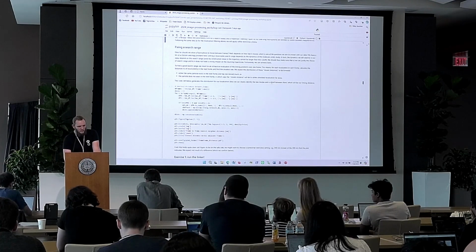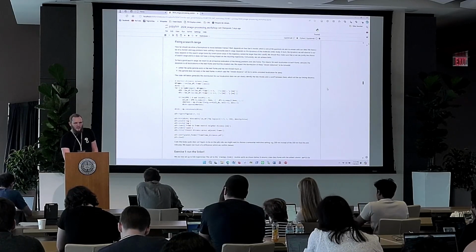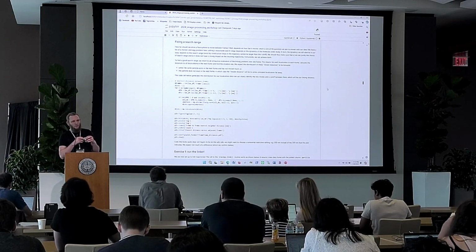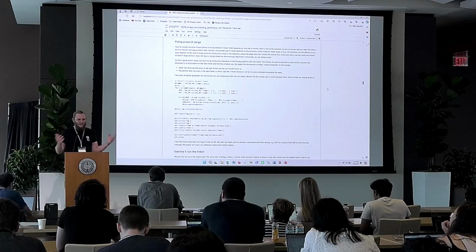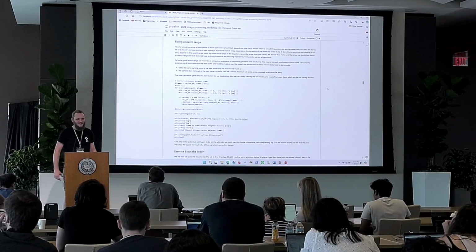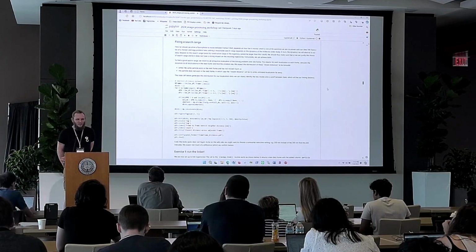The thing we're going to start out with is the search range. So how far do we allow a particle to move? This is a bit of a tricky situation, because how far we allow a particle to move between frames depends on how fast it's moving. If you're tracking very fast particles, you can expect that between 2 frames, they move like 100 nanometers or something. If you're tracking very slow particles, you probably expect that they move less.